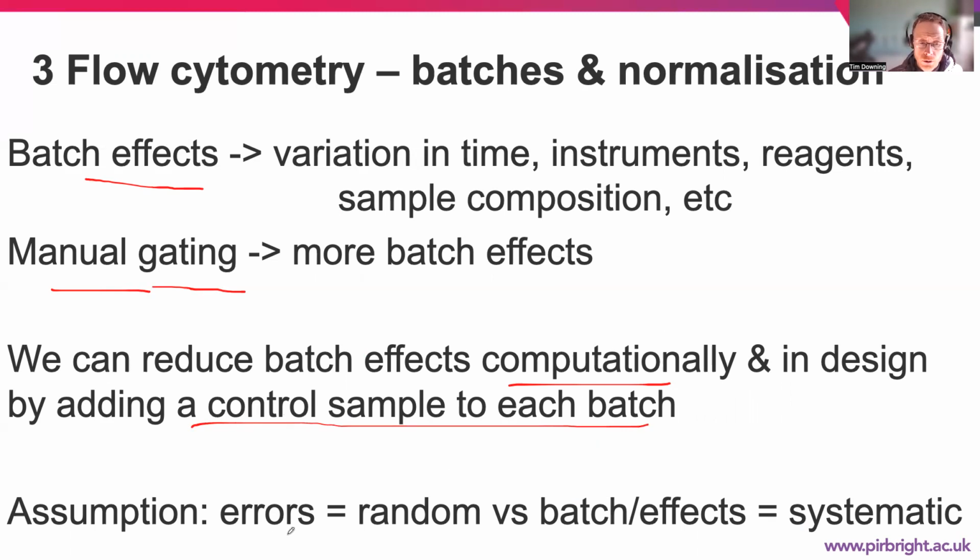Remember that our underlying assumption about all experimental data is that the errors are random, and therefore we can distinguish them from batch effects that are systematic. But distinguishing batch effects associated with an experimental machine, for example, from biological effects can also be tricky unless we've designed the experiment in the right way, such that blocking is used to allow block-based allocation of different samples so that they're represented across the different batches and we can correct for that property.